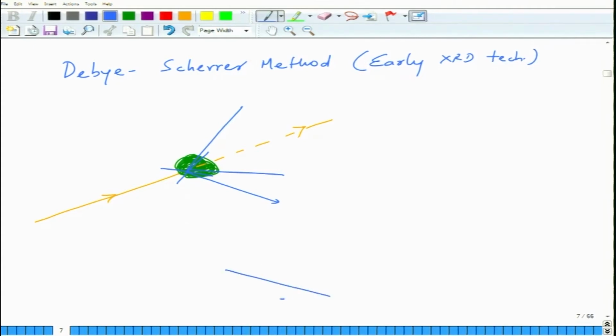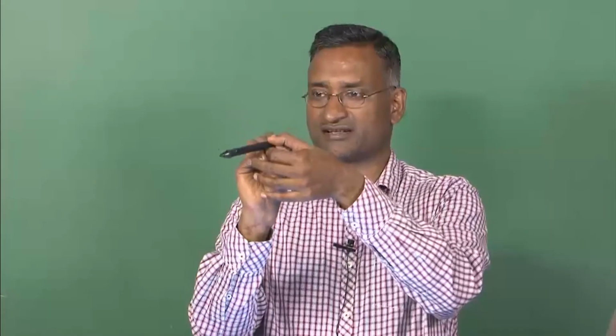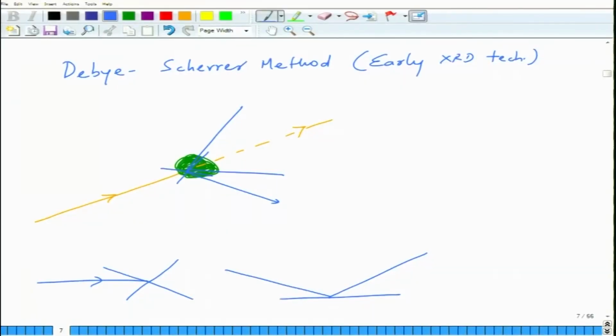So Bragg geometry is this geometry. This is your incident beam. Your plane can be present like this, or like that, or oblique in another direction which we cannot see. So in 3D it is as if you have an incident beam and diffracted beams, one this, another this, another this. They will form a cone. So you will have a cone of diffracted X-rays coming out of the material. One cone corresponds to one set of planes. So this is one cone.